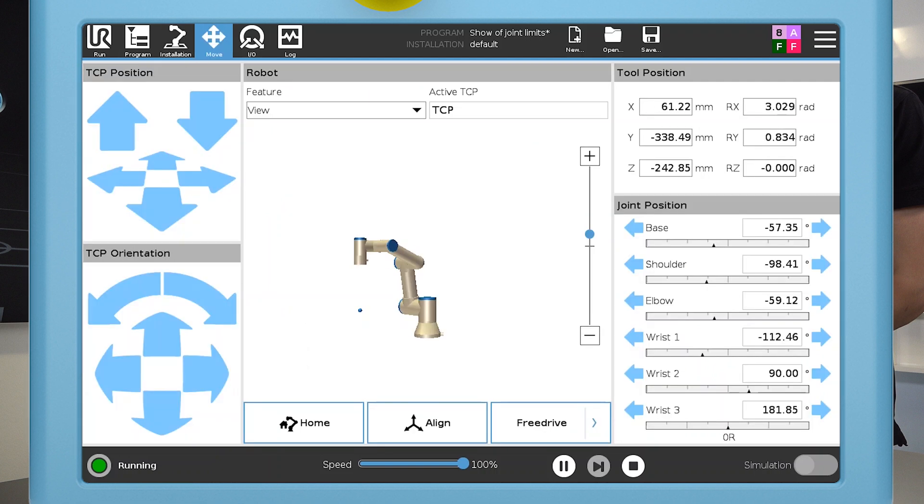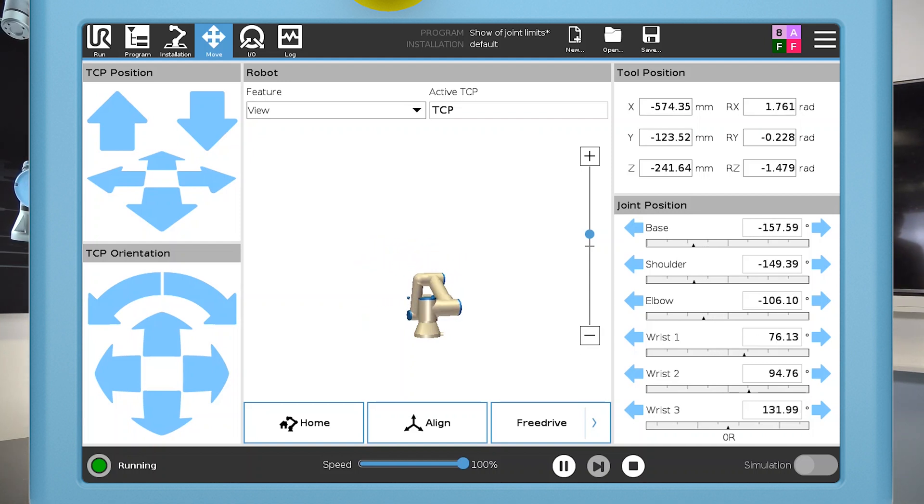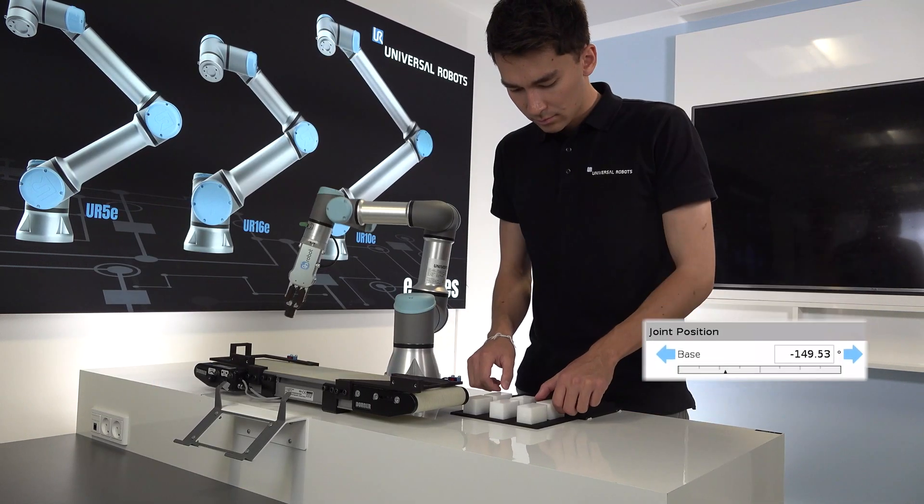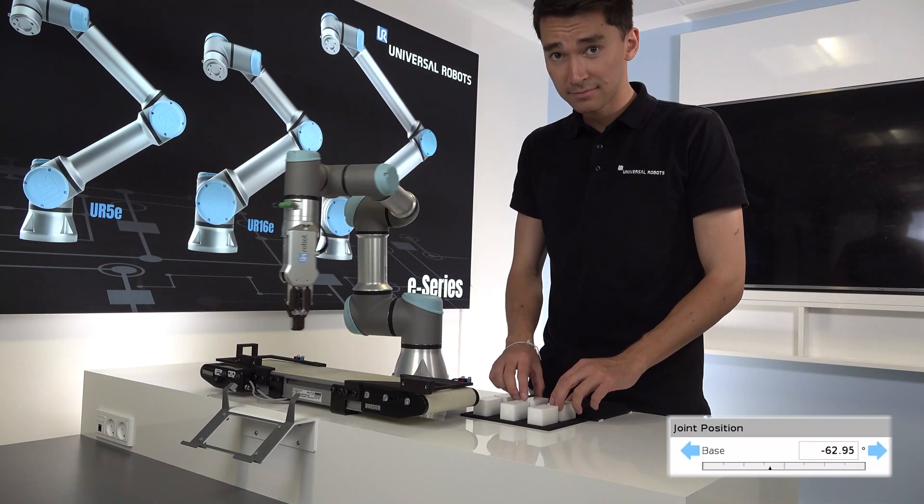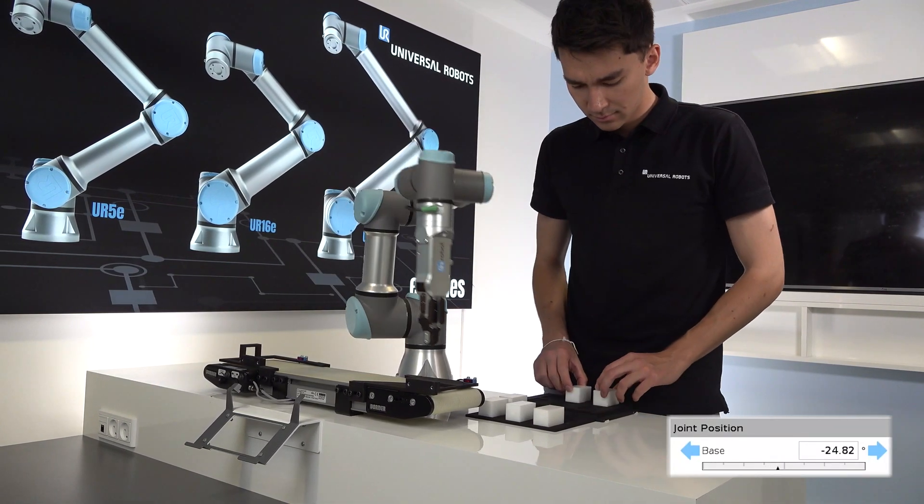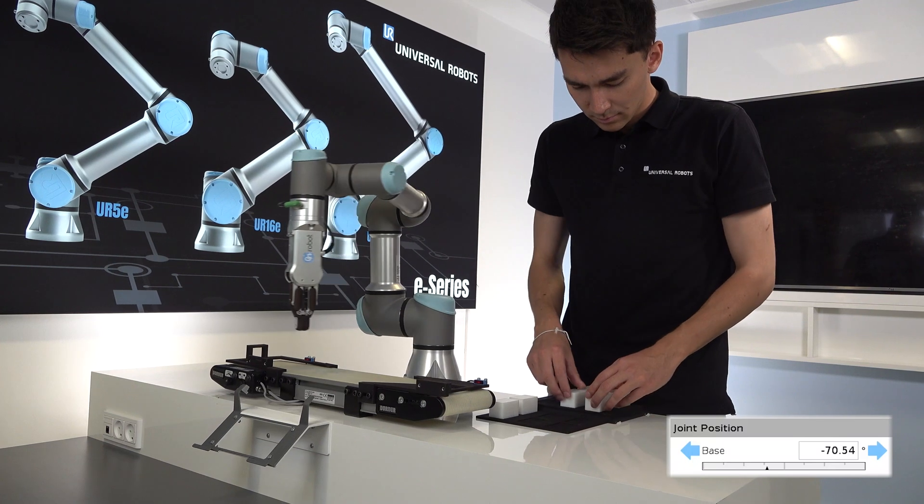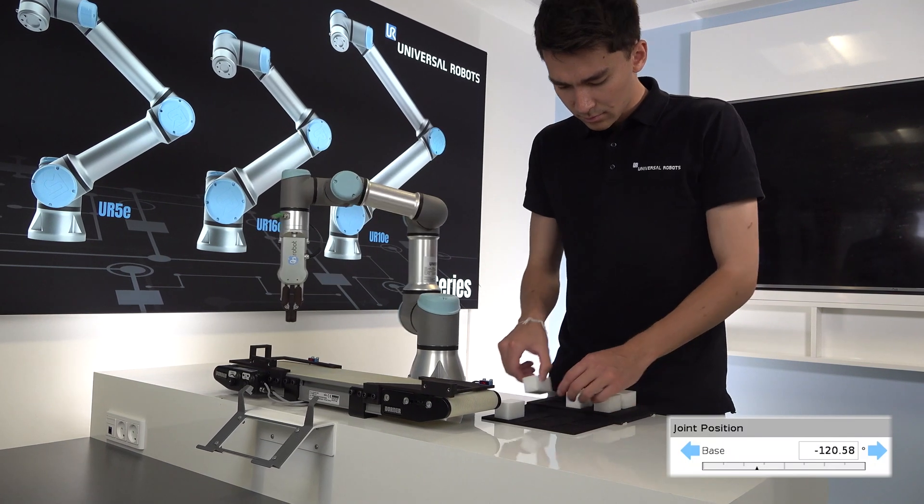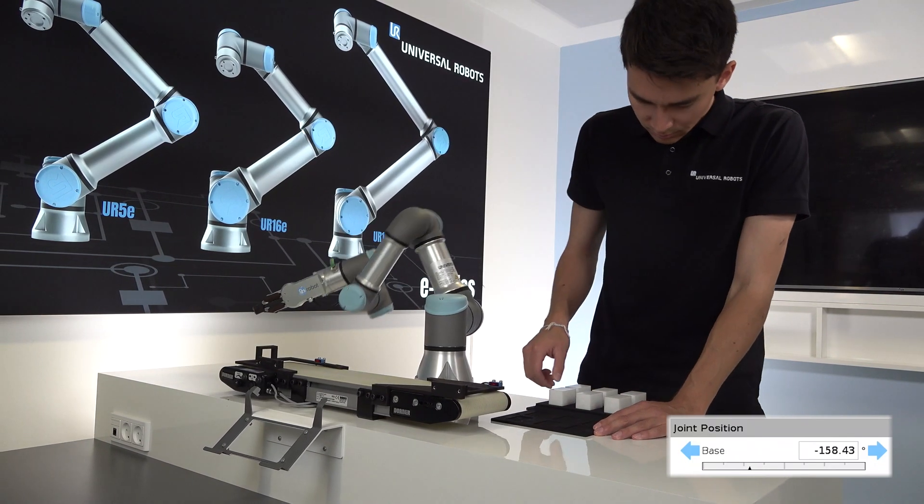For this application, I'll start by looking at the base joint and the range it needs to move within to run this program. In the joint position overview, you can see the range the base joint is moving within. Note down the lowest and highest values.